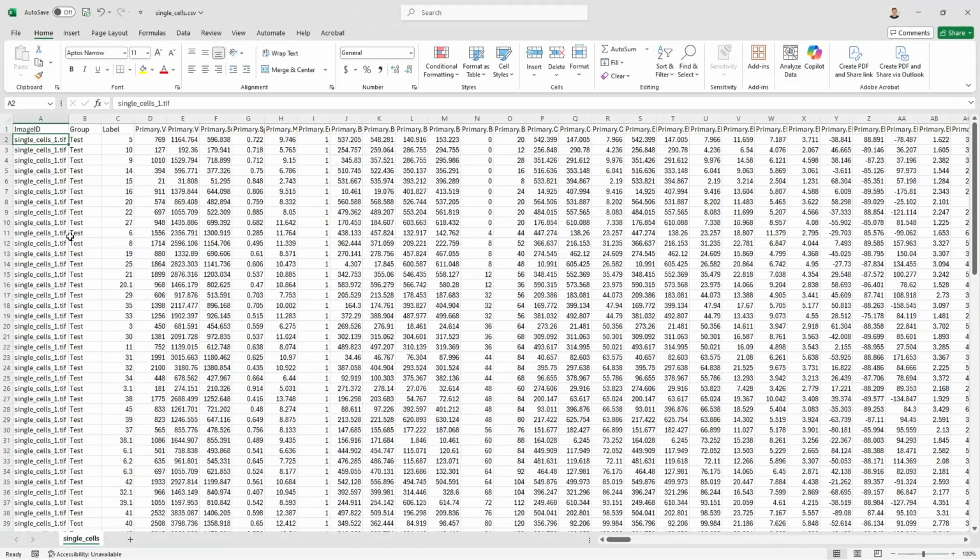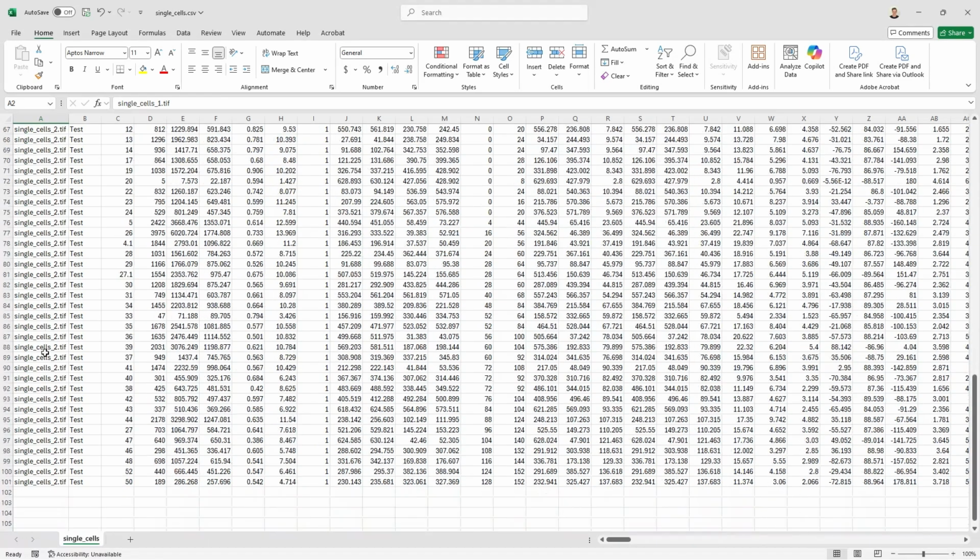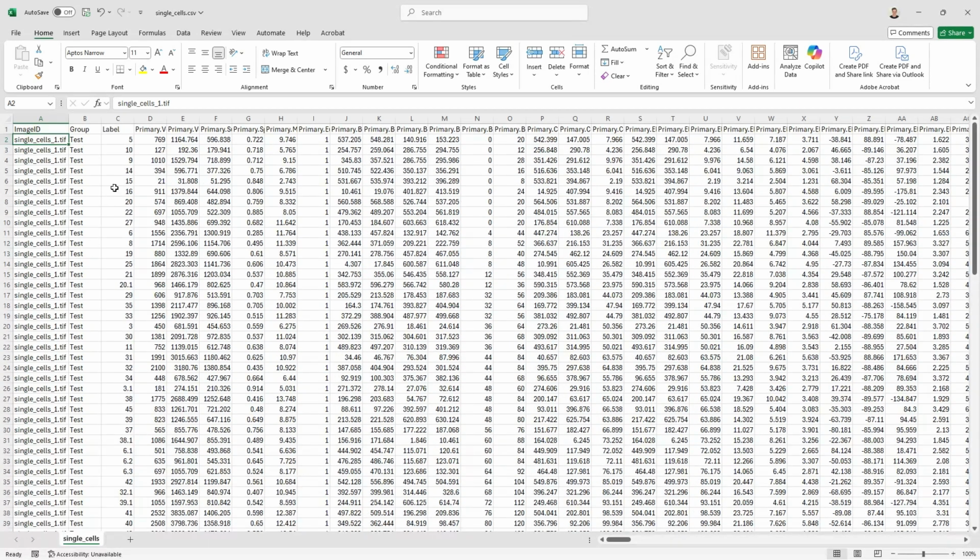So again, we have our single cell name for our images. It's all stored there for us to have a look at. We've got our labels. We've got our indexing for the labels for cases where multiple nuclei were found inside one cell. So cell 3 contains 1 and 2 nuclei. And again, we've got information for our nucleus because that's the primary object.